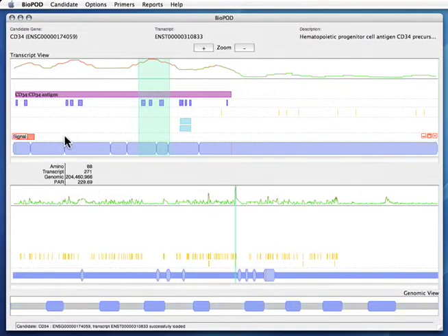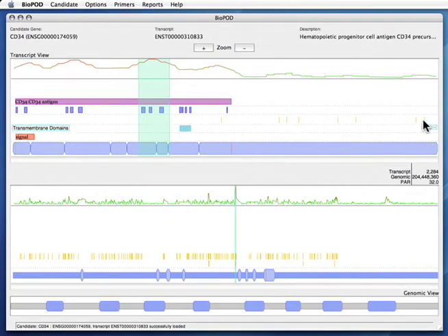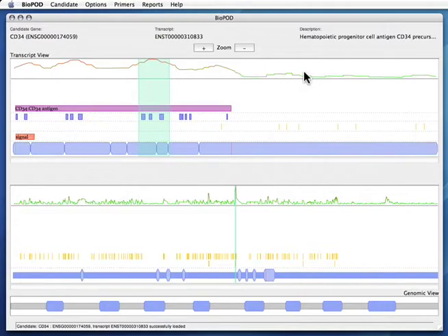Each type of annotation is on its own annotation track. Mouse over the track to see what kind of annotation it is. If the track has overlapping annotation, you may compress the track into a single layer or hide it altogether. You will also notice two graphs, one for the mature RNA and one for the entire gene.